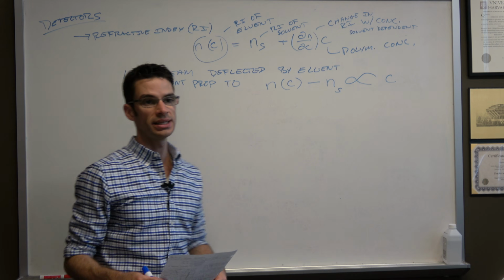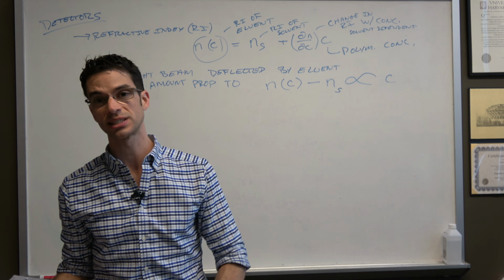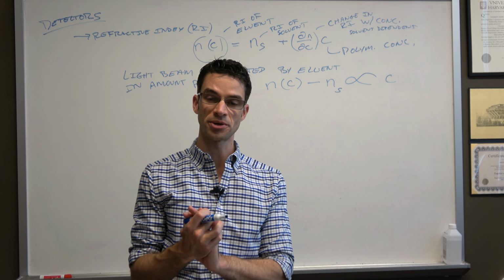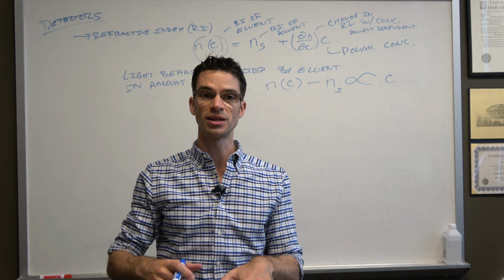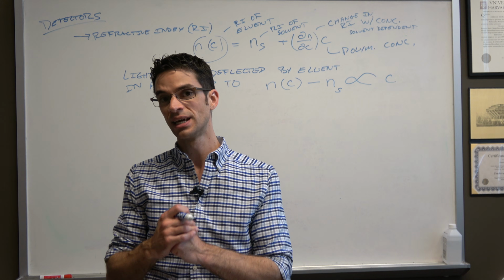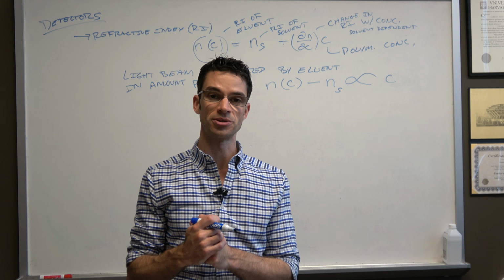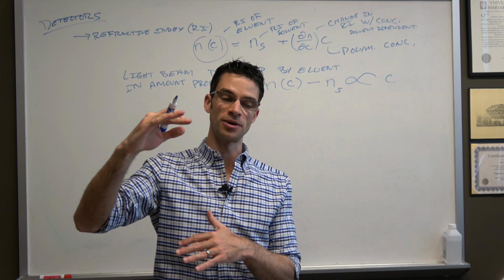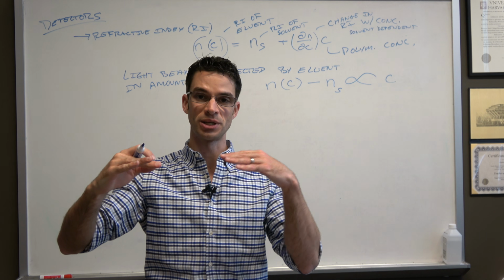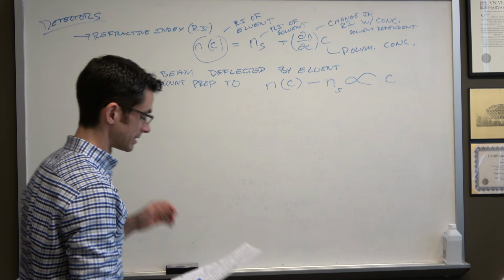Now this works with any polymer that changes the refractive index, but sometimes it's useful to know if you have multiple materials in your column. If they absorb in the UV-vis, you can luckily use a UV-visible absorption detector as well. And this will allow you to resolve one type of polymer that absorbs at a different wavelength from another polymer that may also be present in the mixture that might absorb at a separate wavelength.